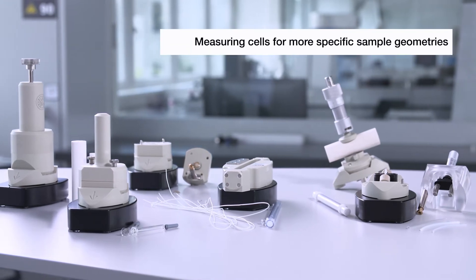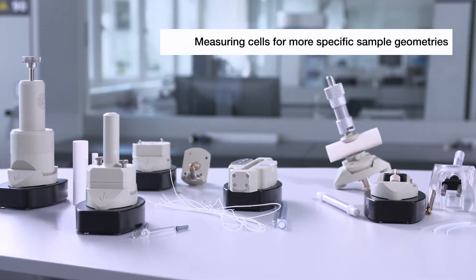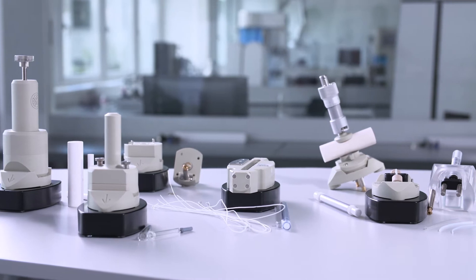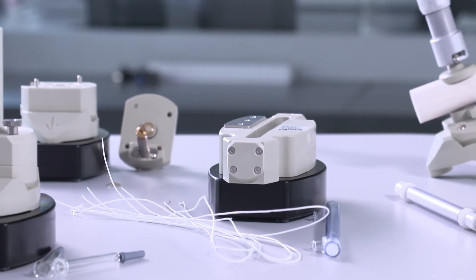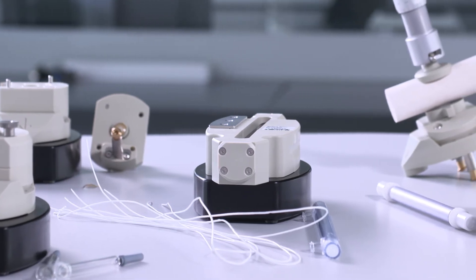Other cells are designed for more specific sample geometries like ceramic membranes, hollow fiber membranes, soft contact lenses, prefilled syringes, or even cylindrical core samples.